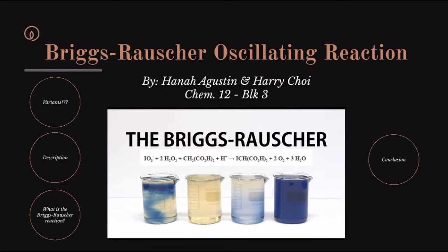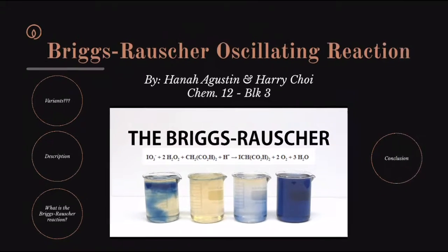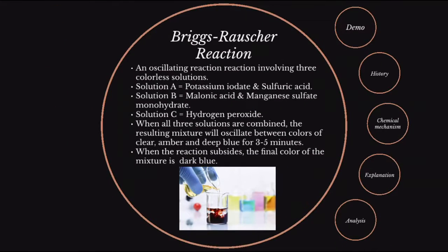Hi everyone, Harry and I are doing our project on the Briggs-Rauscher oscillating reaction. Hope you guys enjoy. The Briggs-Rauscher oscillating reaction demonstrates an oscillating chemical reaction involving three colorless solutions.